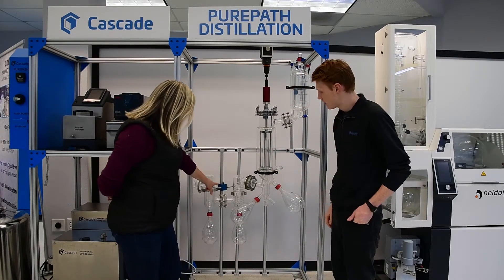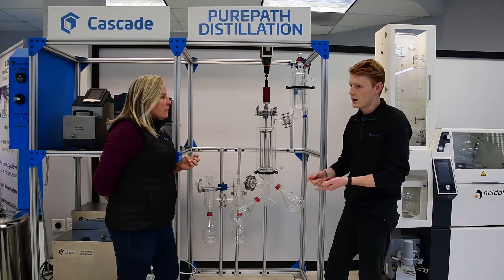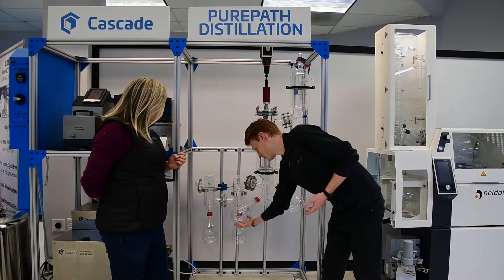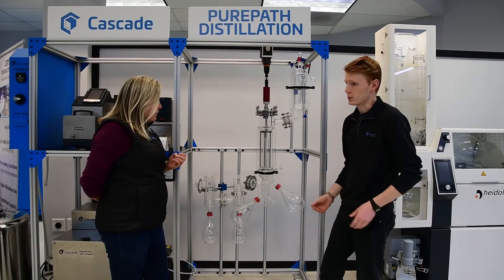And then tell me what's going on here with these two cold traps. So these cold traps are good for catching volatiles like ethanol or really light — lighter than your light fraction — constituents. And they protect your vacuum so that when you're running this, it doesn't ruin it.